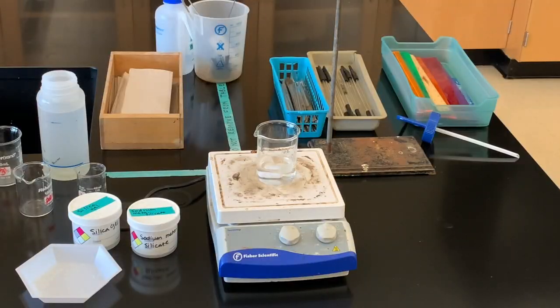This lab is the polymers lab. Here I'm starting on the preparation of the water glass.